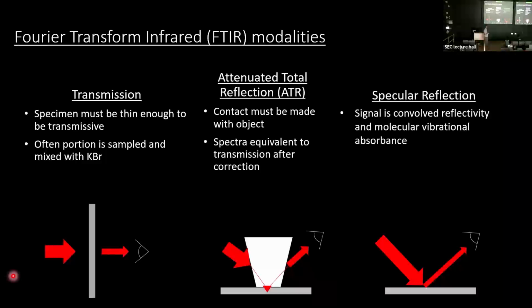This funny icon here is supposed to be the profile of an eye. It's physicist shorthand for detector. It actually took me a couple of years as a physics undergrad student to figure out what that was supposed to be. I knew it was supposed to be a detector, but it's supposed to be a profile view of your eyeball with the eyelids.